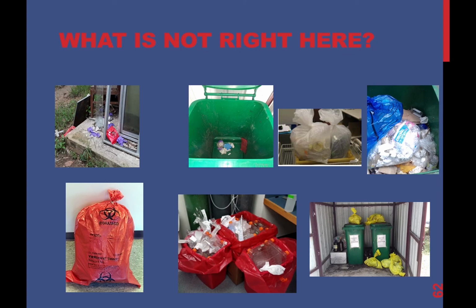Now in the third picture we can see that there are two bags that are stuffed very tightly in a tray that is not able to accommodate these two bags. So whenever you autoclave, you put bags in such a way that steam can penetrate and they are not overstuffed while you are autoclaving, because you want each and every area to have access to steam.